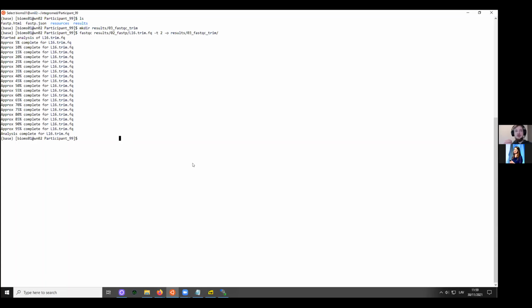In this case, I used Ensembl because from the information I've gathered online, I guess it has the most comprehensive annotation. It's possible that different reference sequence sources could be better for different analyses, but that kind of information you'll have to find out on your own by doing the research.